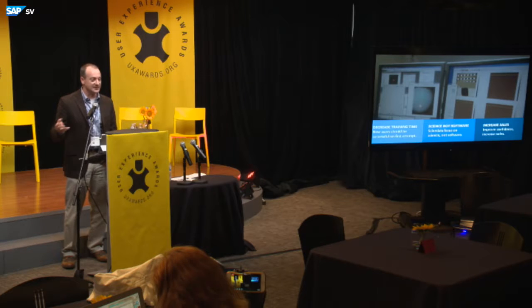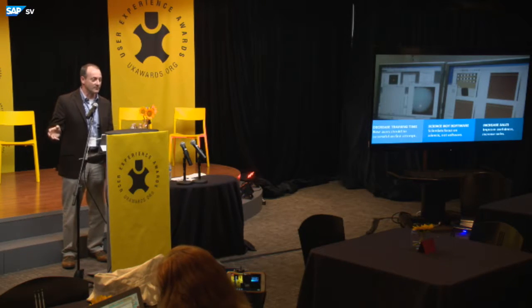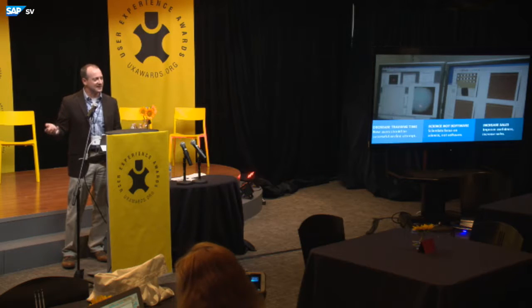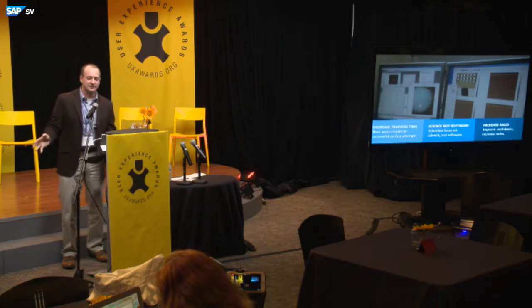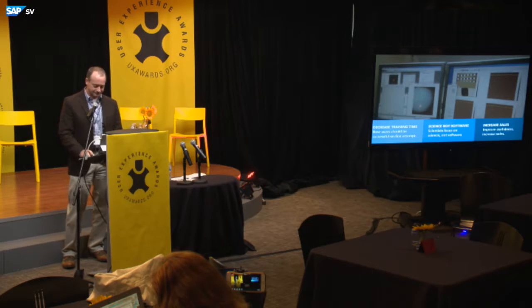Universities can only buy these things once every 5 years or so when they get new grants. They cost anywhere from $250,000 to $500,000, so people just don't own one of these for themselves. But in order to sell these, they had to be usable by a very different class of users in industry than somebody who's been a physics professor all their lives.